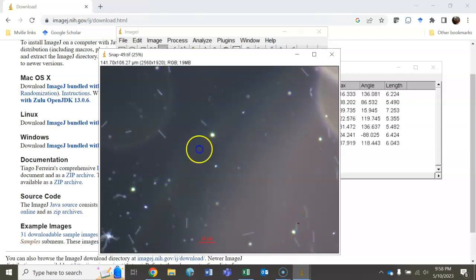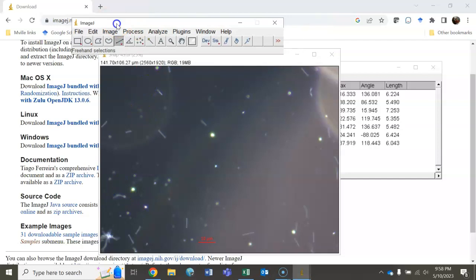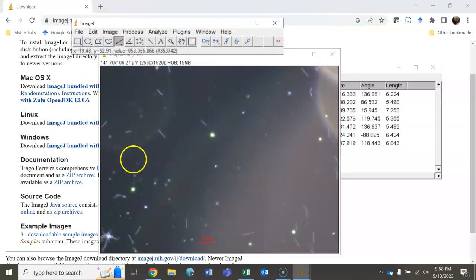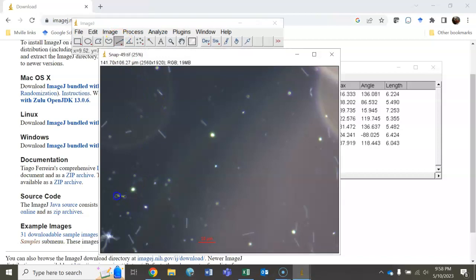This one I probably wouldn't grab. This one also seems out of focus. It might be two spirochetes. This one also, you could grab it. It looks like two spirochetes. Just make sure whenever you're doing this that you're staying within the same parameters. If you say this is going to be one spirochete, all the other images you look at, for example, if this is a wild type and I'm comparing this to a mutant, make sure you're always grabbing the same.